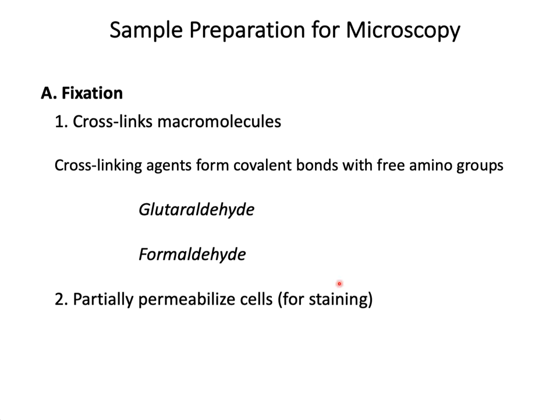So start with fixation. Live cells are in a dynamic state. The organelles are moving, the vesicles are being trafficked, motile cells such as macrophages and neutrophils are on the go, lower eukaryotic cells are motile. All the movement complicates microscopy because as the cells are moving around, resolution is lost and the image is blurred. So fixation takes care of that by actually freezing the cells and stops all that movement. It also kills them, which may be good or bad.